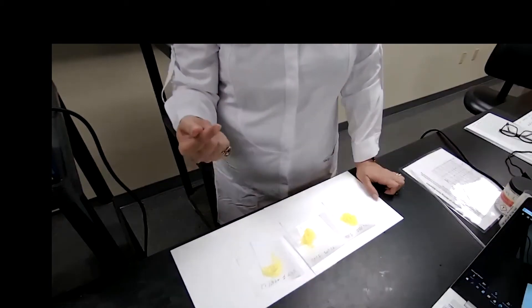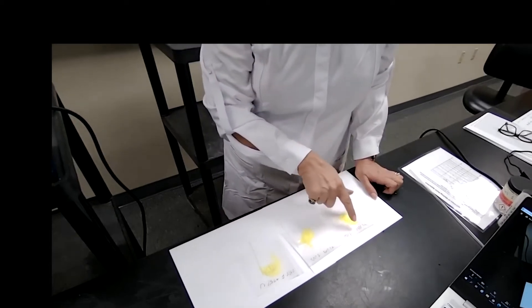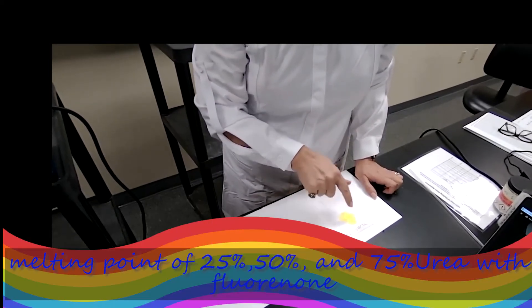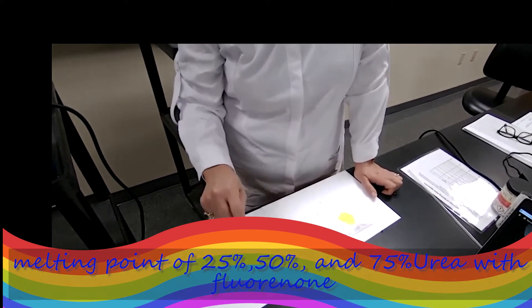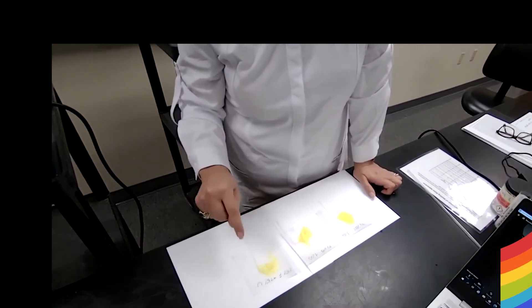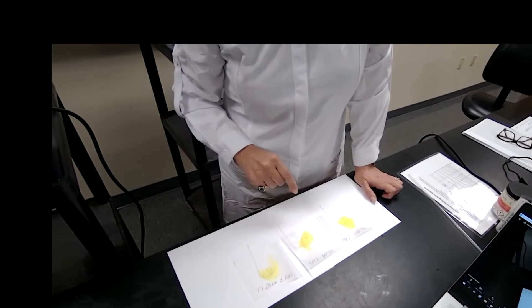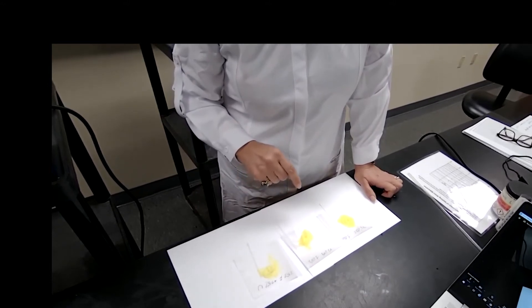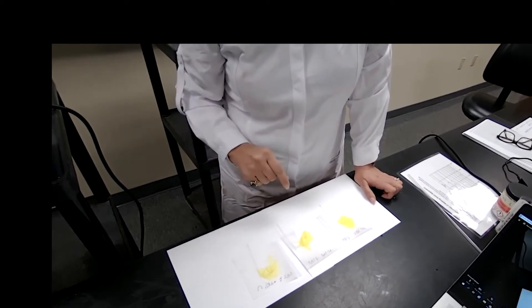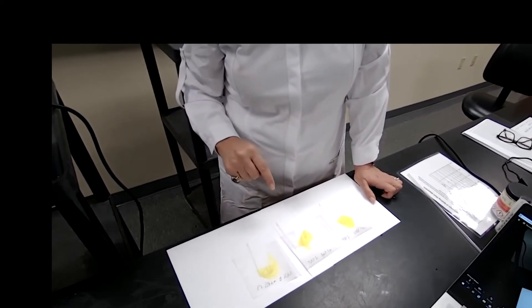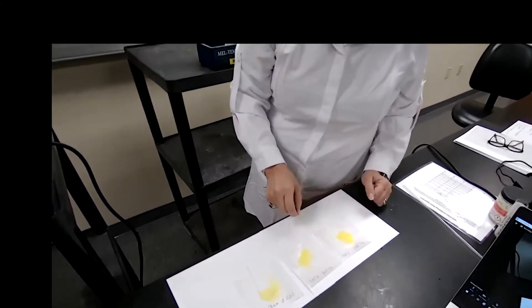The three samples that we have are 75% urea with 25% fluorenone, 50% fluorenone with 50% urea, and 25% fluorenone with 75% of the urea. So we are going to look at the difference in the melting point and I have the samples prepared. Let's move on.